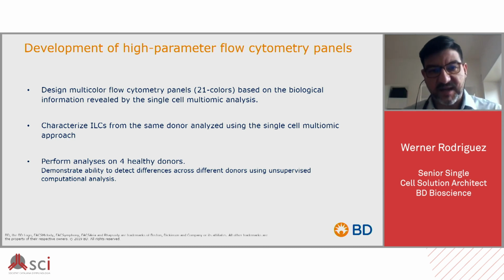What has been done is to create a flow cytometry panel using 21 colors, based on the biological information revealed by single cell multiomics analysis.